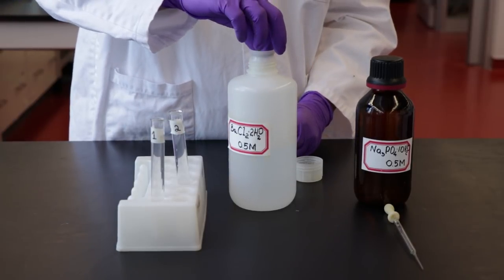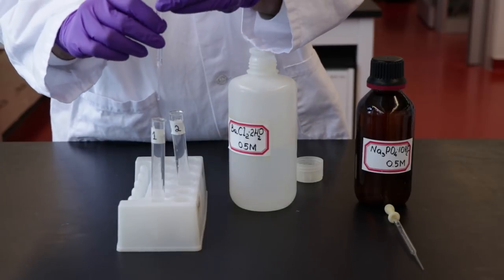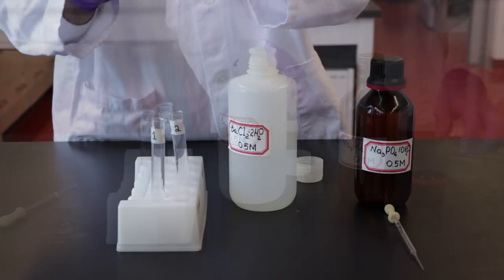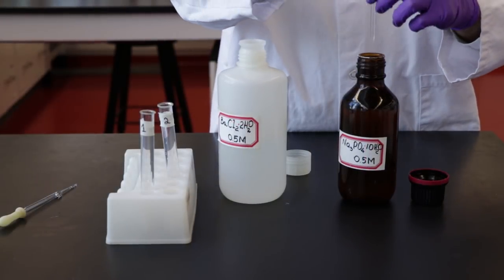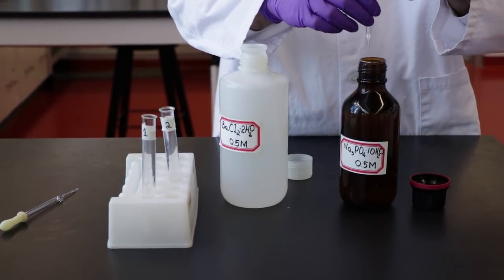Add two drops of 0.5 molar barium chloride into test tube one. Then add two drops of 0.5 molar sodium phosphate into test tube two.